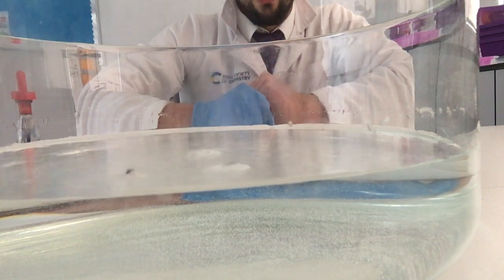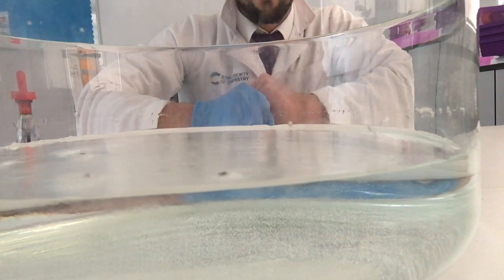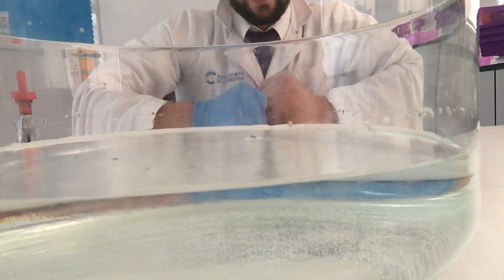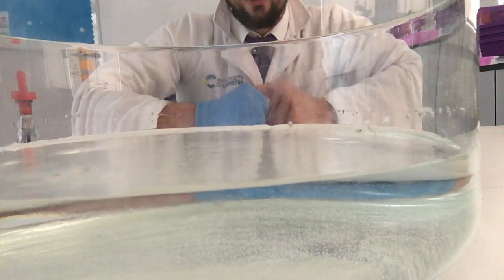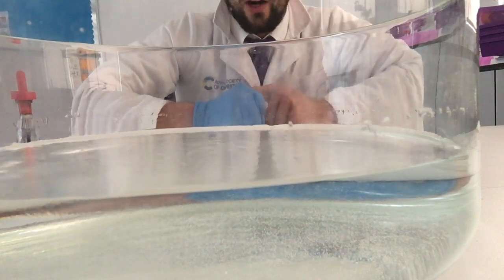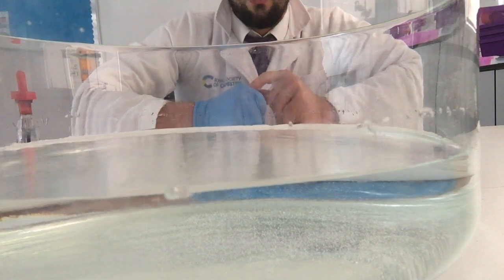Very good. Look at those bits of lithium moving around, reacting quite violently with the water. The lithium and the water react to produce hydrogen gas and lithium hydroxide. We can see the gas because of the bubbles. In a moment, I'll show you how we can see the hydroxide. I will let that one finish up, and then I've got one more to do.